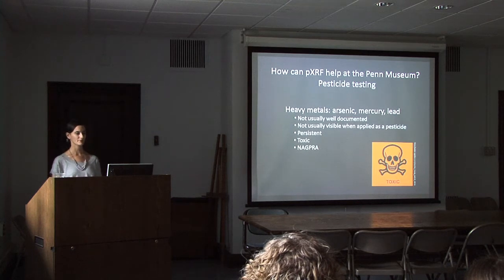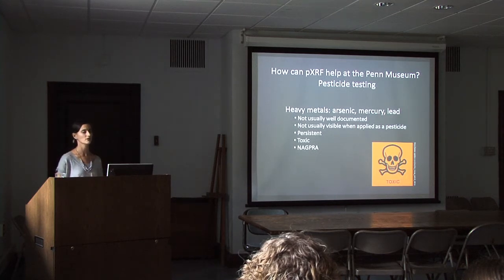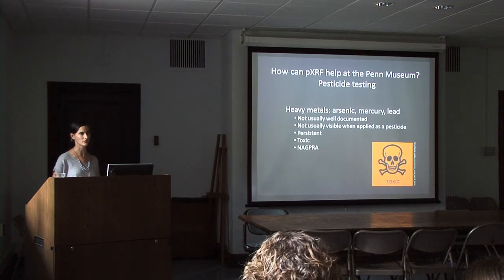Because the heavy metals are persistent, they don't evaporate, they don't disintegrate, they stay present. It's important for us to know whether or not they're present because they're toxic to us as people. And a specific case where that is more important, because at a museum here, we know that pesticides were used, we can protect ourselves, but we also repatriate some of our artifacts. And typically the ones treated with heavy metal pesticides are organic. Many of them are in the American section, also in the Oceanian section. And if we're going to return material to Native people, we need to inform them about how they need to protect themselves as well.